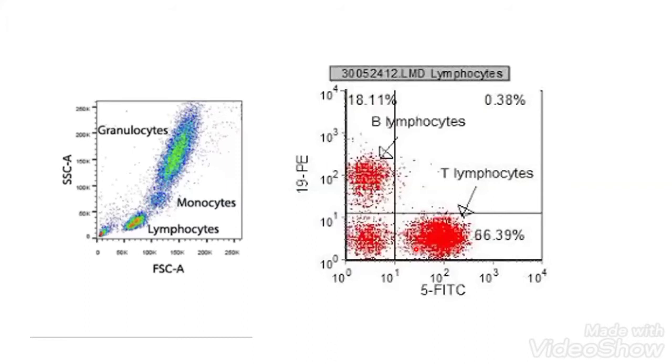So you can analyze 7,200 blood samples after creating a huge study to understand whether your drug is able to modulate the count of T lymphocytes and B lymphocytes in the subjects, in the animals, in the patients before and after the treatment. And you can analyze 7,200 samples in 24 hours. So before flow cytometry, the same thing was taking 3 years to do. After flow cytometry, the same thing is taking 1 day to complete.